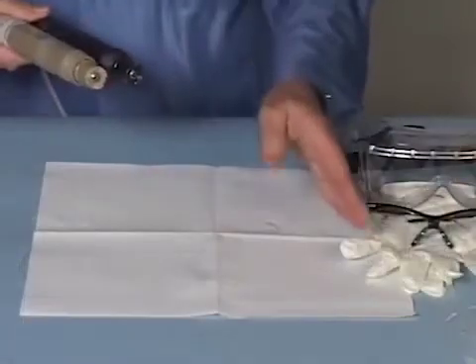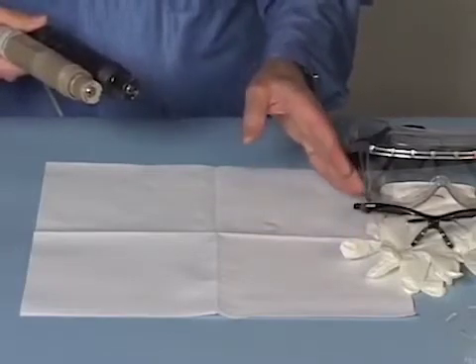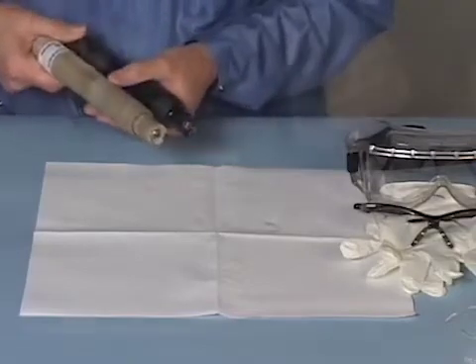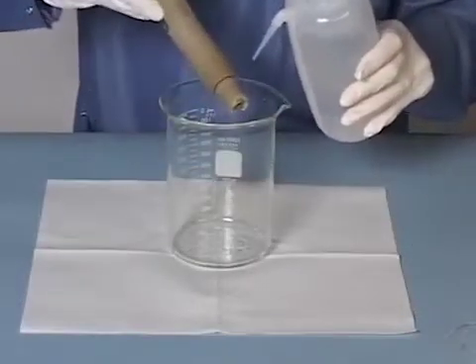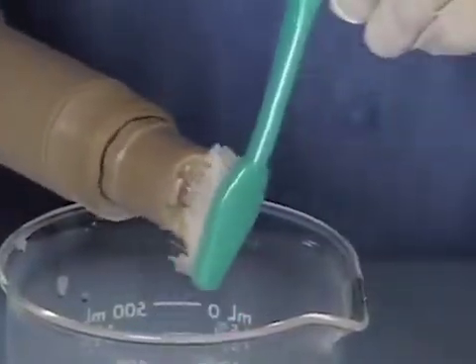It is a good idea to wear gloves and safety glasses to protect your hands from your process water. The buffer solution won't harm your hands. First, clean any debris from the probe head by rinsing with DI water and gently scrubbing with a soft bristle brush as needed.